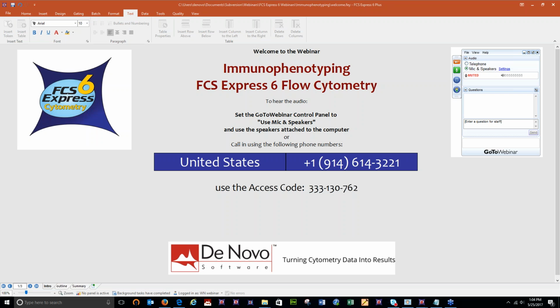Attending. Today we're going to do an example immunophenotyping workflow. And it's going to be rather brief, just to give you an idea of the software functions that you will need in order to perform a typical immunophenotyping experiment.